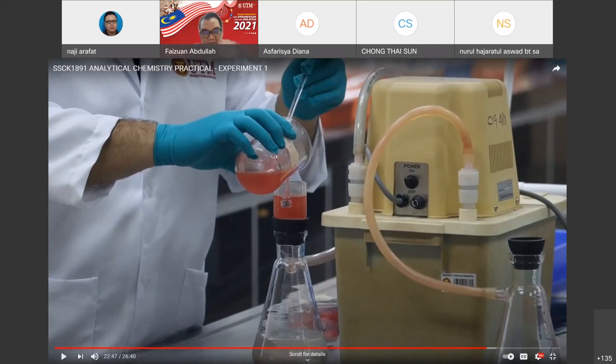Alright, guys. Why do we need to do this filtration process using this suction filter? Anybody can give your idea? Why do we need to do this? Faster, alright. Of course, it is faster using the suction filter, right? But why do we need to filter?